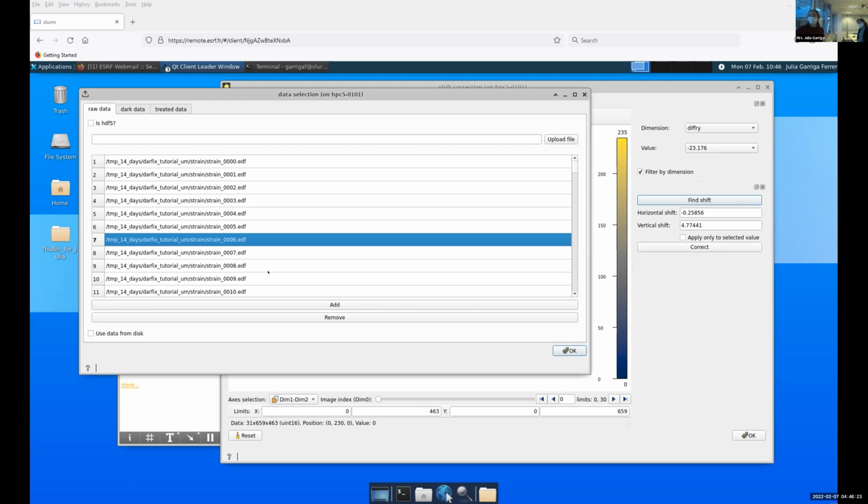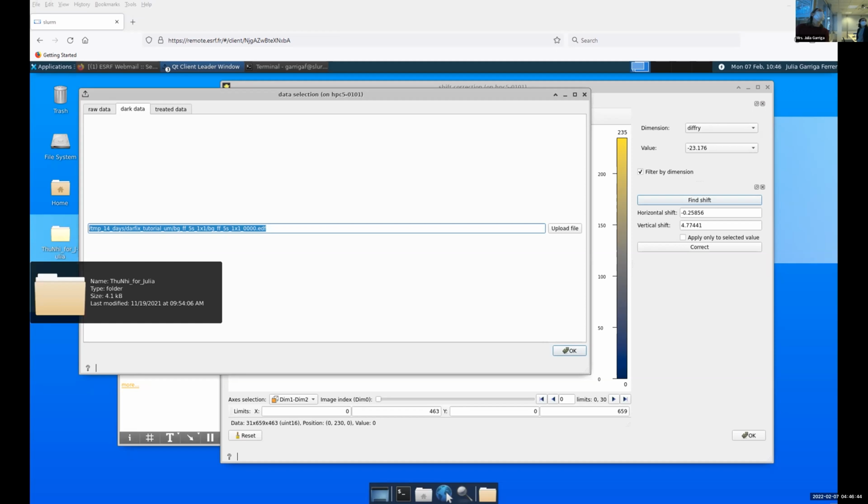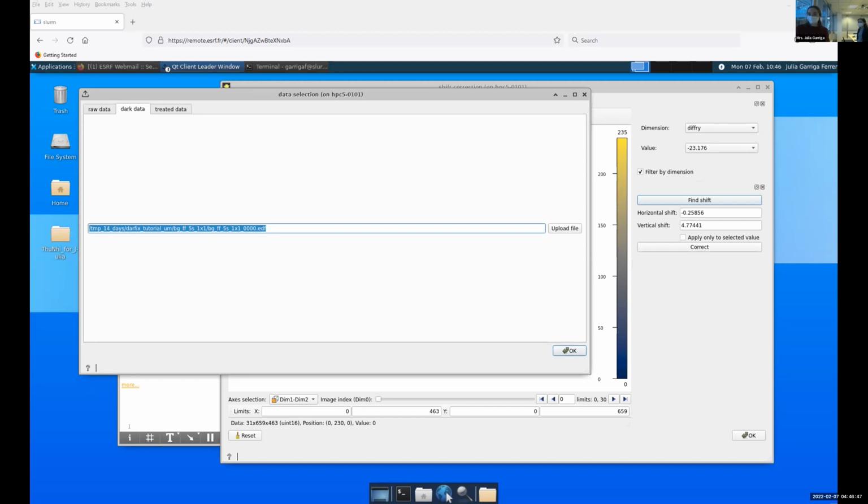Yes. So for those that have connected now to Guacamole, and have currently opened the range, you should be able to also add the different dot files. I will put it also on the chat. If anyone has had to restart and is a bit lost or has problems on previous widgets, we don't mind being asked flashback questions. It's okay. Exactly. This is a tutorial, and of course, if we were here in a one-person room, we would be with each of you. You would each have your data sets, and we would be checking that everything's okay. Yes, exactly.